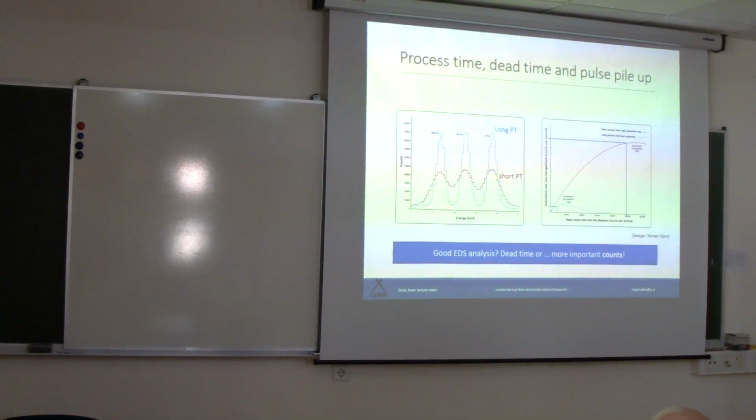And if you use the short process time, you see that the graph really changes, so you get more counts because you can process them quicker. And again, it's better to be here than here because the statistic will be better, more counts.